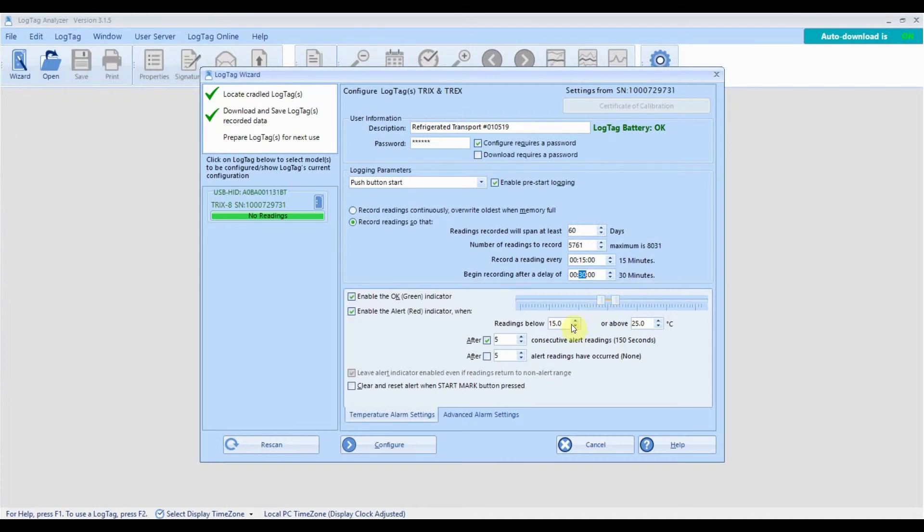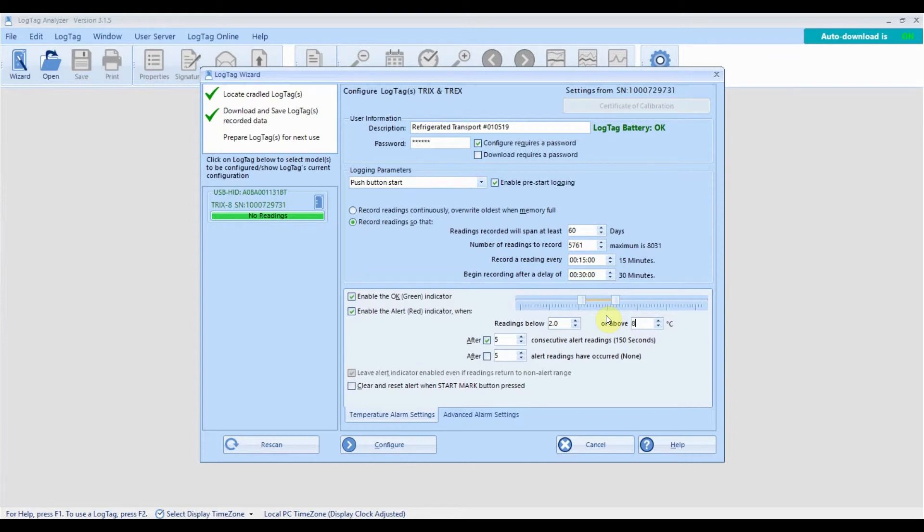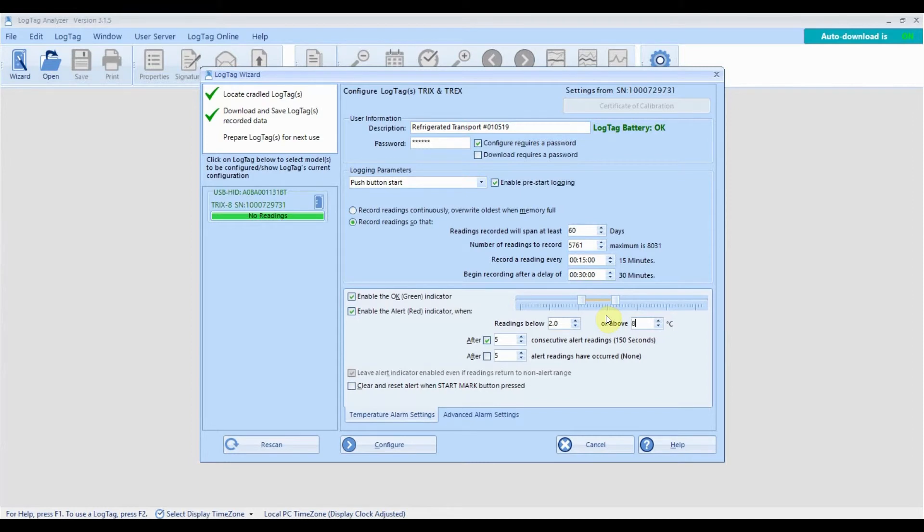Enter temperatures that you wish to trigger an alarm should the logger record a temperature that meets or exceeds the alarm value specified. In this example, the logger will immediately trigger an alarm if the recorded temperature exceeds eight degrees Celsius or drops below two degrees Celsius. If you want to clear the alarm and continue recording, tick the clear and reset option.